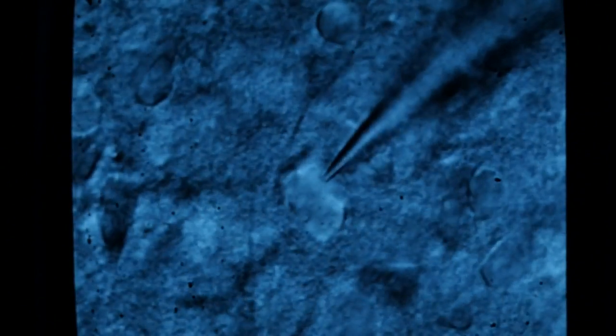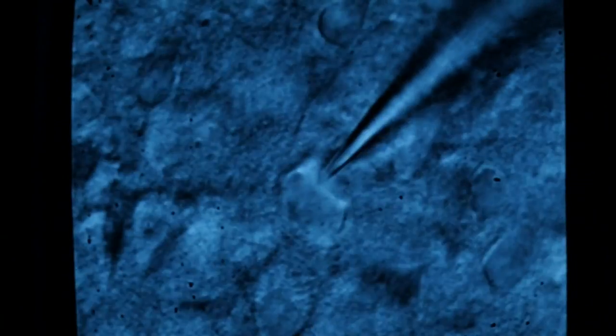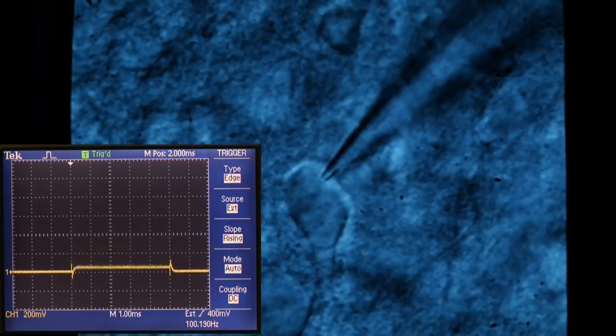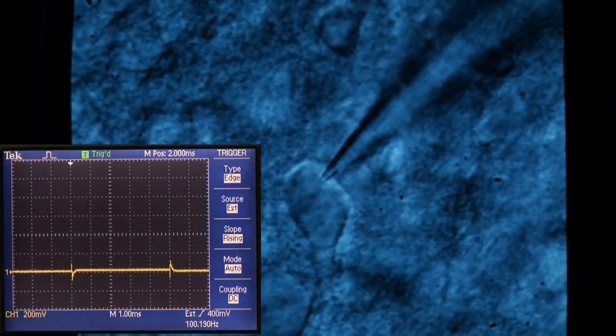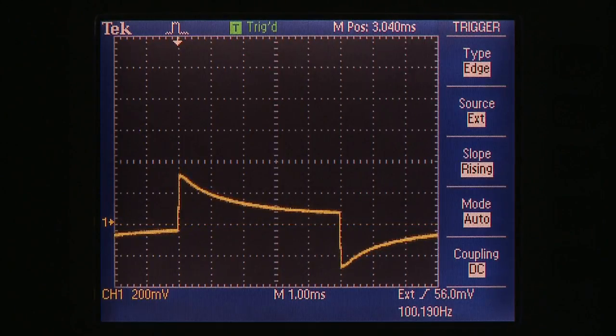Then we reach our cell step by step. First we focus deeper and then we go down with our pipette. When we reach the cell, we touch it carefully and move the pipette slightly towards the cell body. Now we see a small dimple where the tip of the pipette touches the cell body. Then we remove the pressure and suck gently to establish a giga seal. When we have a giga seal, we do further brief suction pulses to break the membrane in order to establish the whole cell patch clamp configuration. Sometimes we have to continue the suction pulses to improve the opening, reducing the access resistance between the electrode and the inside of the cell.